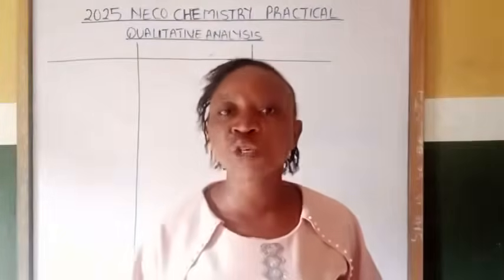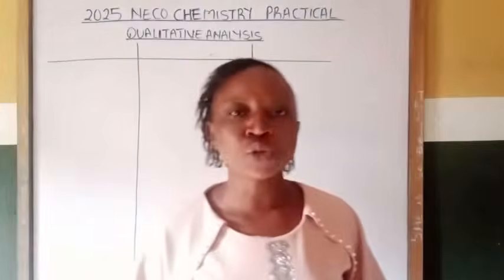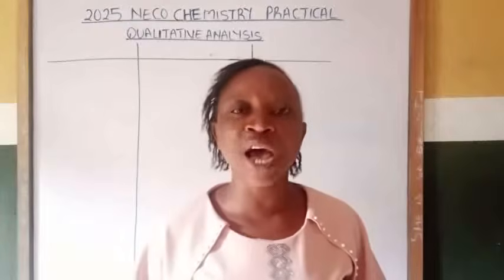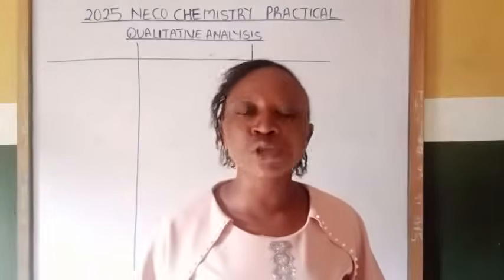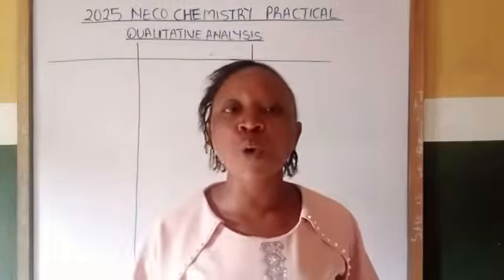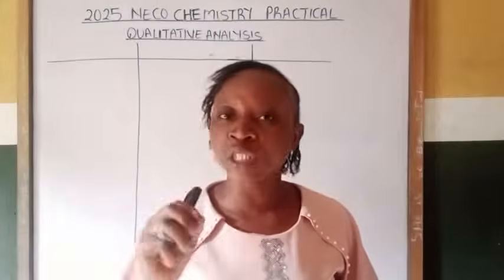My name is Oluwatoyin. In this video, we are going to discuss the 2025 NECO chemistry practical, and we'll be looking at the second aspect of this practical called qualitative analysis, also known as salt analysis. I'm going to teach you how to answer questions on qualitative analysis without carrying out the experiment. I taught them like this in WAEC, and what I taught them answered 100% of the questions that came out. Please don't overlook this video.